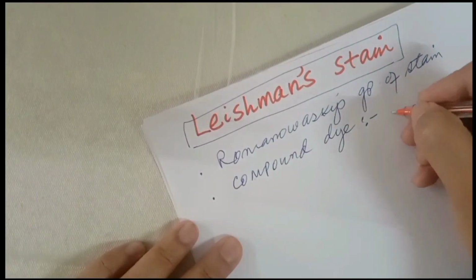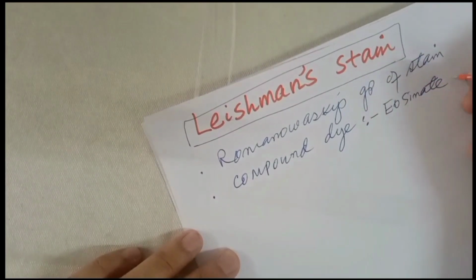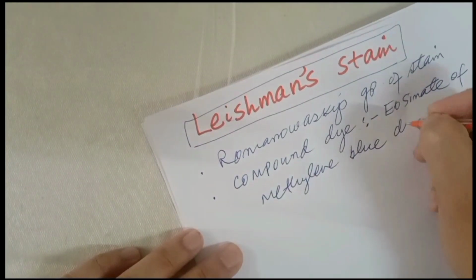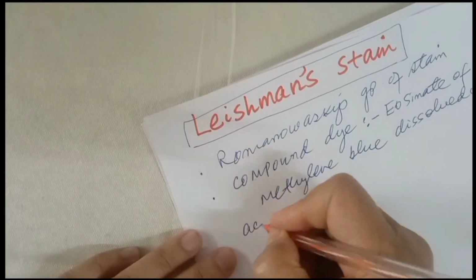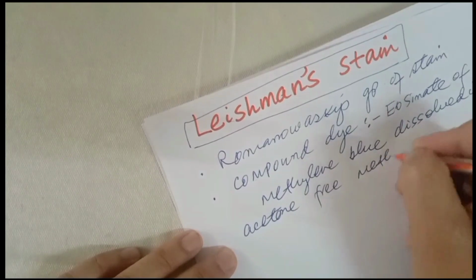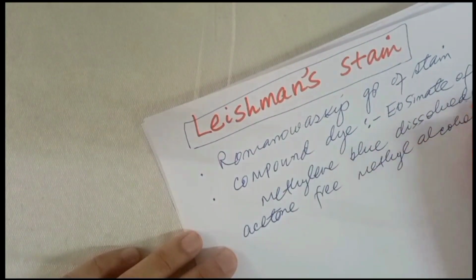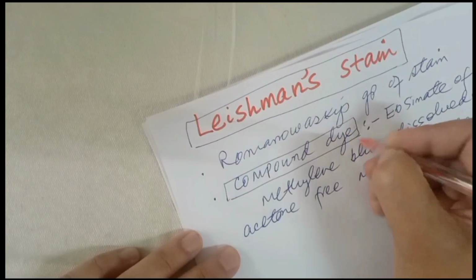Compound means it has eosinate of methylene blue dissolved in acetone free methyl alcohol. So it is a compound dye.